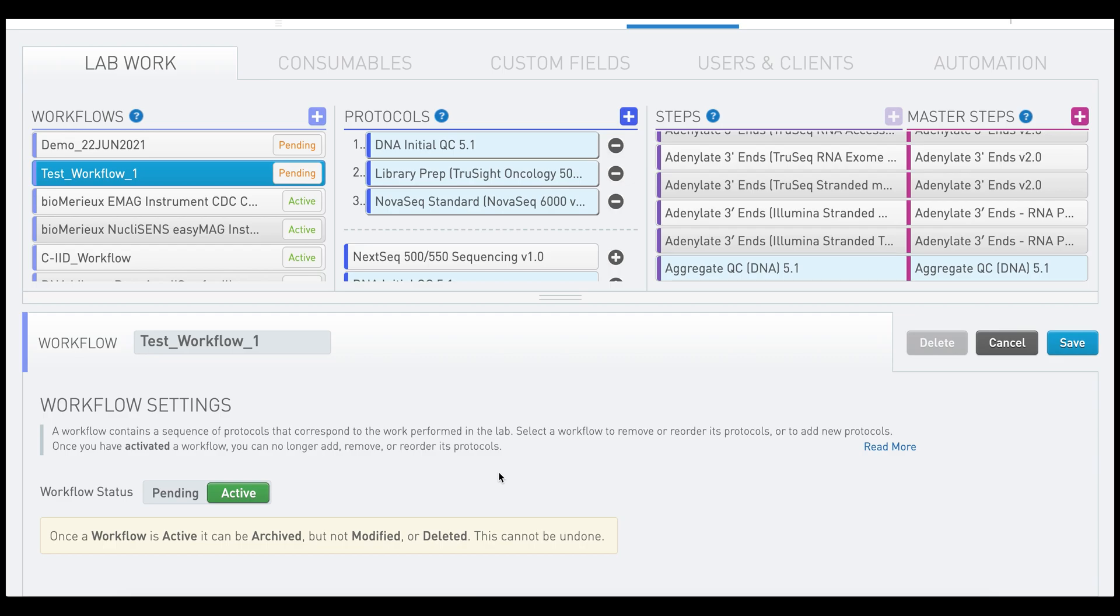A yellow popup will appear that states once a workflow is active, it can be archived but not modified or deleted. This cannot be undone.